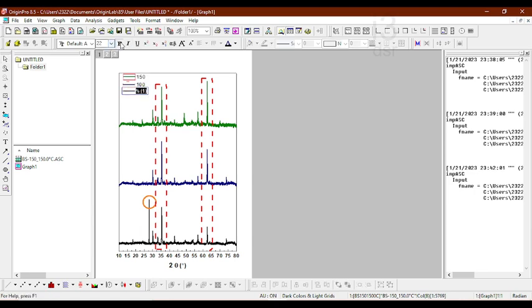Select this, get into bold, font size to 24, hit bold, increase. Now our graph is completely ready. We just have to put intensity here. I'm going to put the text box, click here, right?